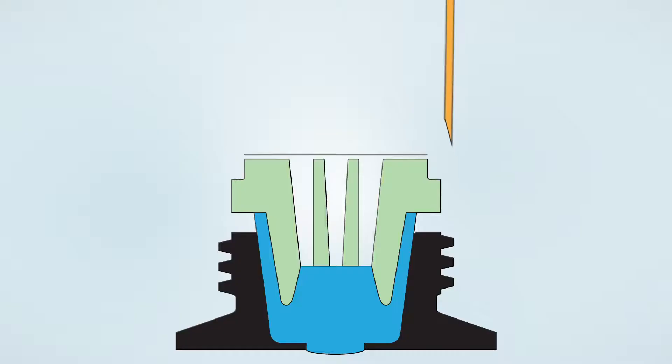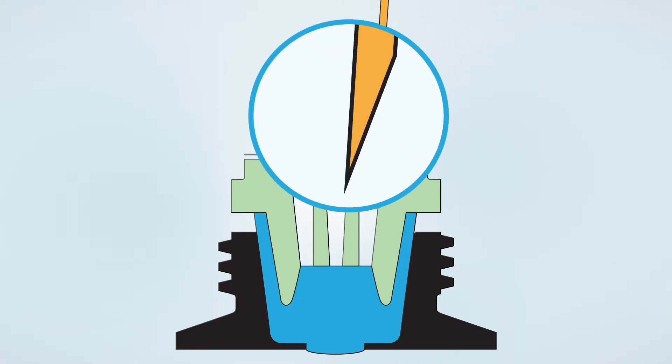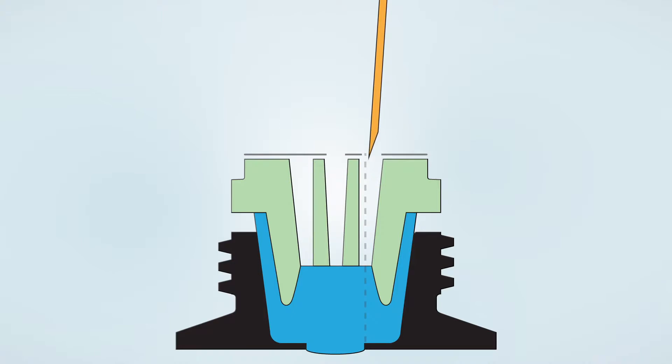When inserting the needle into the center channel, push the needle straight in. The six remaining needle channels are slightly slanted toward the center. Turn the bevel of the needle outward. When using these channels, push the needle in at a slight angle as indicated by their position on the septum.